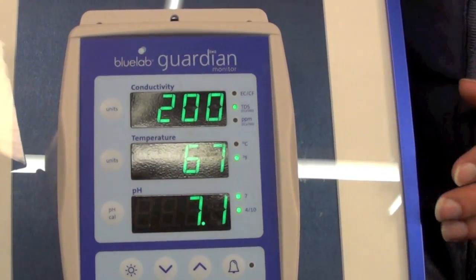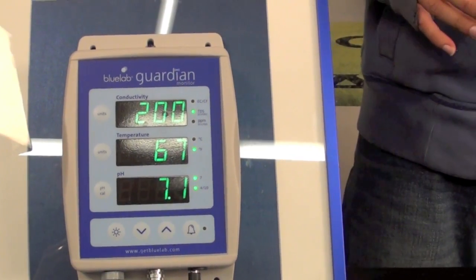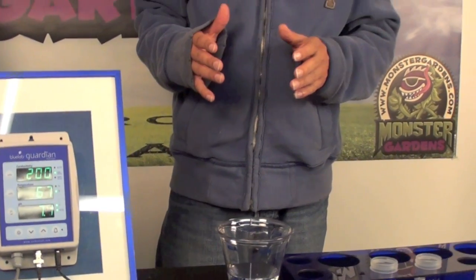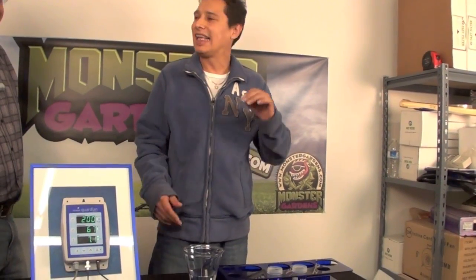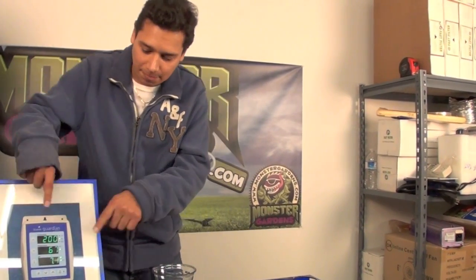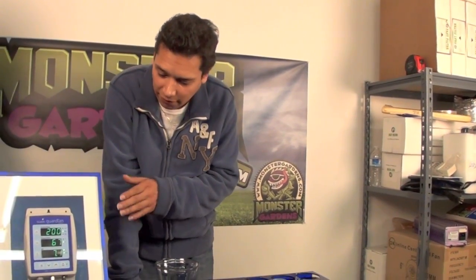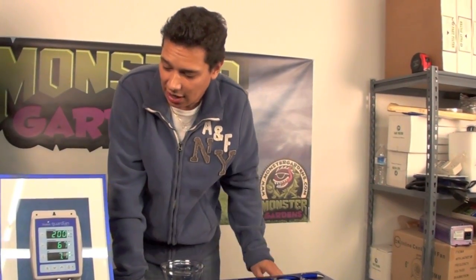Another thing I like about this unit is that it's a centralized unit with probes that are separate. When you've had 15 years of experience and bought pretty much every PPM and pH meter on the market, you realize that the pH meter is the first thing that goes. When you buy a HANA or any other unit that comes as a two-in-one combo, the pH meter will fail before your PPM meter. Now you have a failed meter and have to send it back for your pH probe — leaving you with no meter at all, not even a PPM meter. It's always good to have them separate, because the pH probe is the part most likely to fail first. In this case it's completely separate — you can order a replacement while you still have your temperature and PPM readouts.